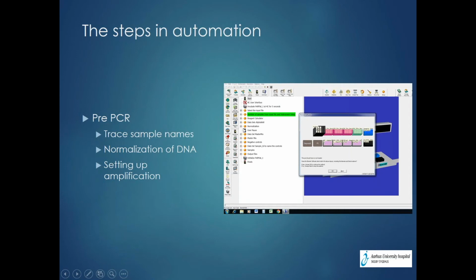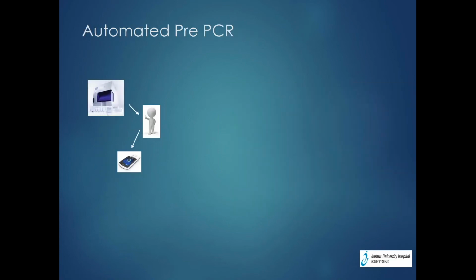The programming is done here by the software, and it tells these different tools what to pipette. That's the really neat thing about this station, even though it's a small automation station: you can put the tools on it that you need. In this instance, you can have single channel or 8-channel pipetting, and of the volumes that you need.